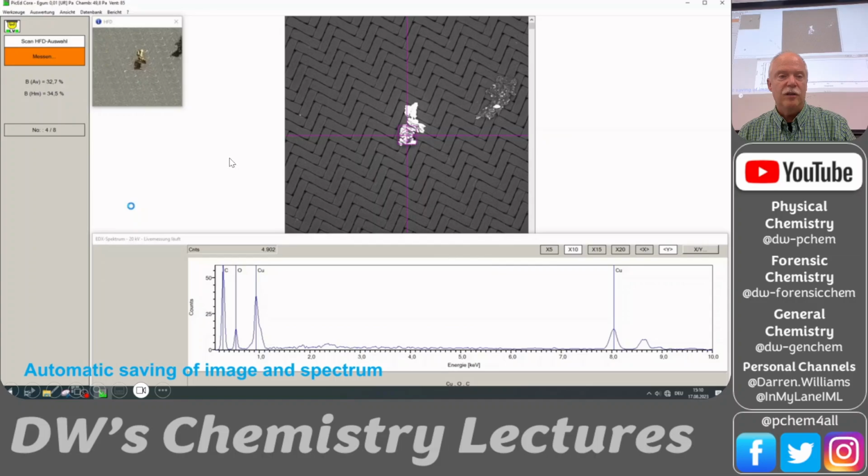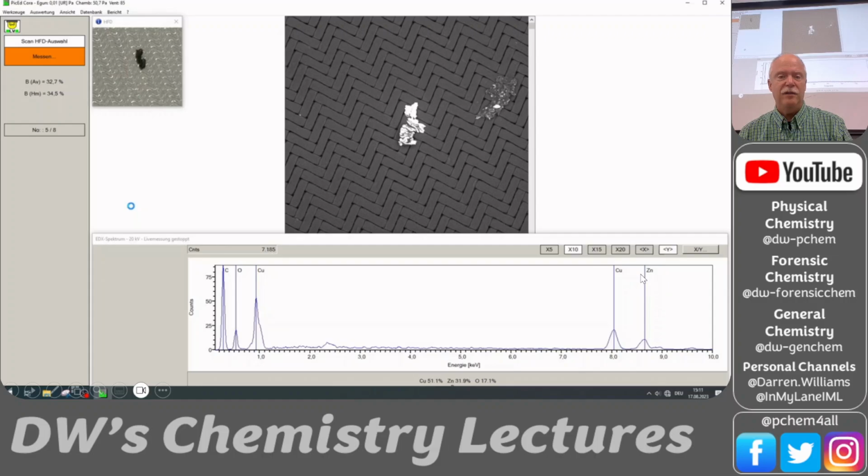What about this one? See, it's a little bit of a yellow color in the optical, so it might suggest a copper or a brass, and sure enough, you see here copper. Maybe a little zinc, okay? And here we hit it again with the X-rays, and you get zinc, more zinc. And so what is copper and zinc? That's brass. So this is a brass particle.